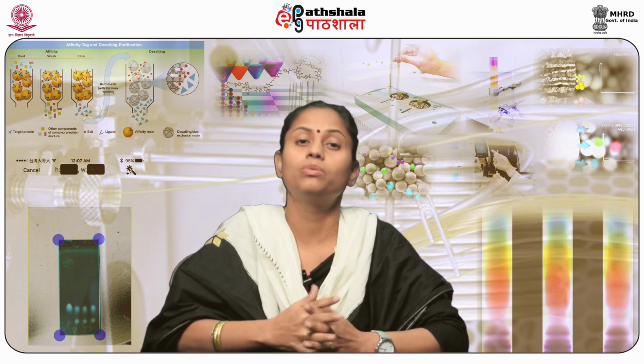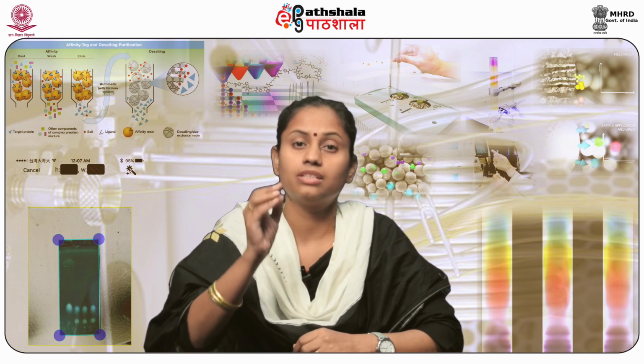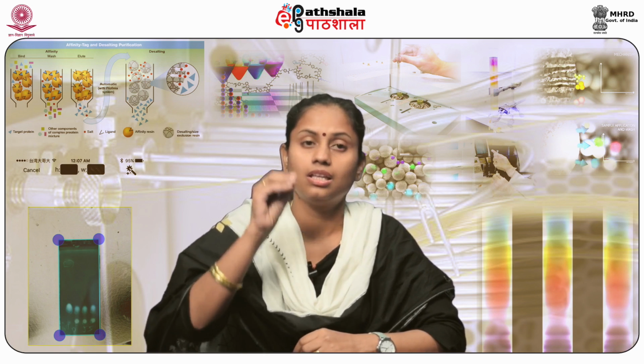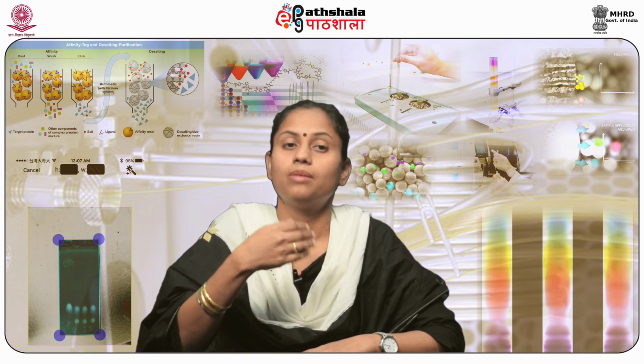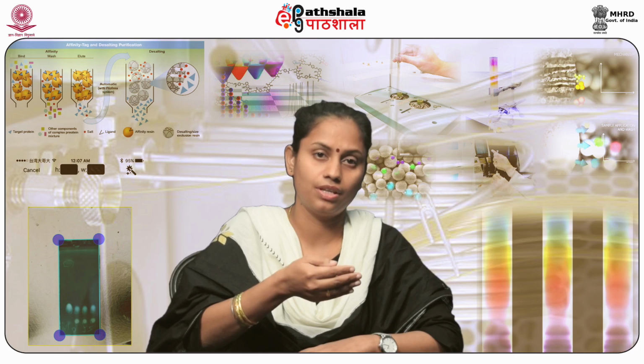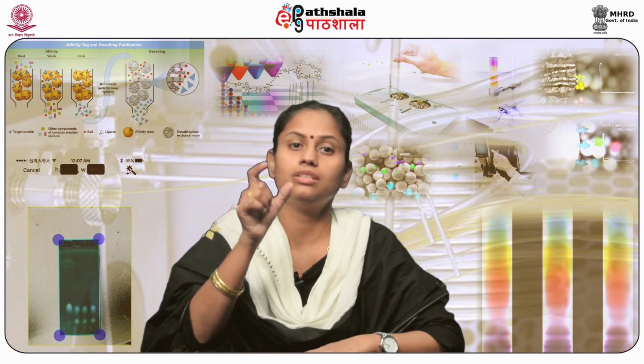The next common term which is used in chromatography is eluent. Eluent is the solvent that basically contains the analyte, that is the product or the compound that we have obtained by carrying out the chromatographic purification. During chromatographic procedures, usually a combination or a mixture of solvents is introduced into the system as the mobile phase. According to the binding affinity of the analyte in the mobile phase, it elutes from the column. Eluate or effluent is another term which is used in chromatography. It is actually the mobile phase that leaves the column after the procedure.